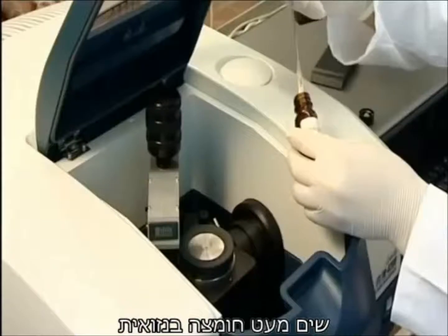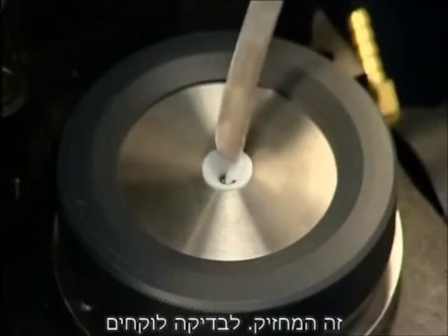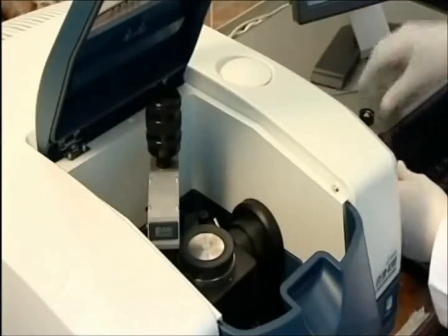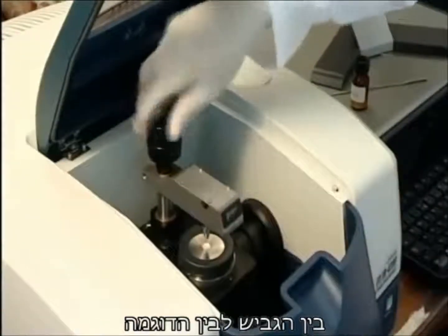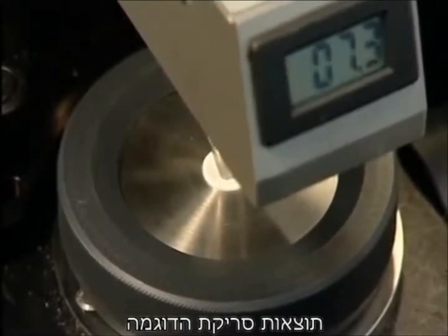A little benzoic acid is placed on the ATR crystal. This is a holder for solid samples. Less than a milligram of solid sample is required. The torque wrench is used to squash the sample to ensure a good contact with the surface of the crystal. For most samples, no preparation is required.